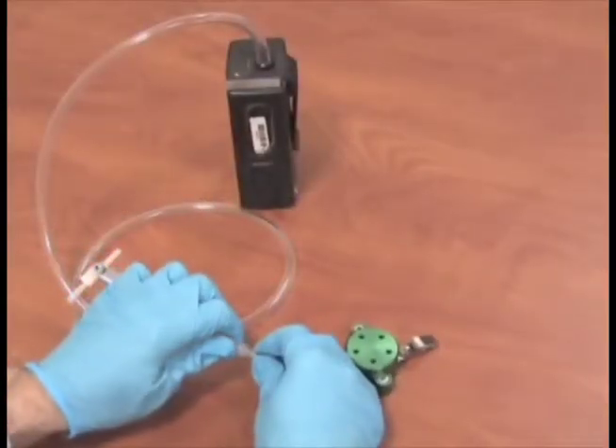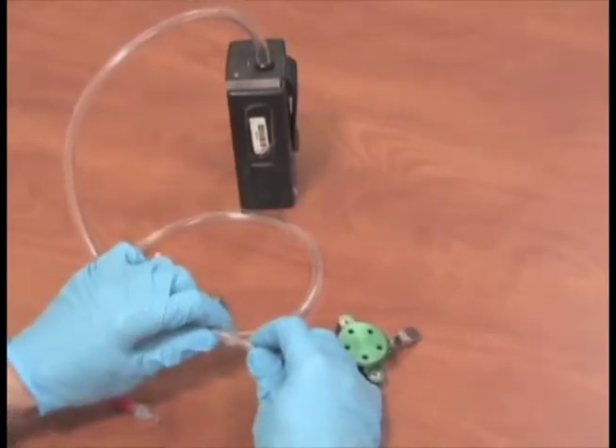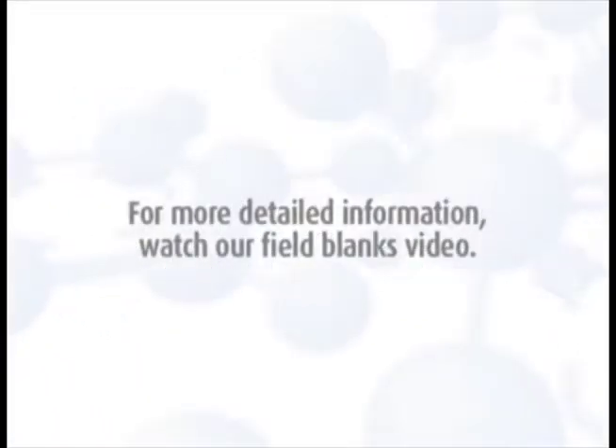Remove the transport end cap and install the PEM on the end of the Tigon tubing coming from the pump. Remember, a field blank should be collected for each sample set and should accompany the monitor during all periods except actual sampling. For more detailed information, watch our field blanks video.